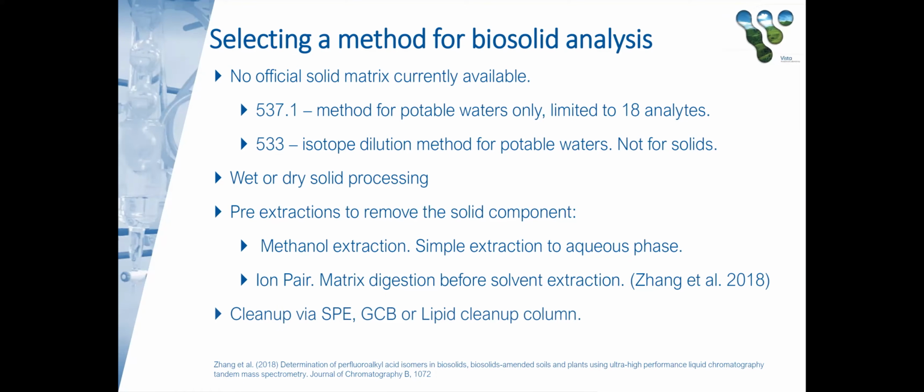Also, because we're monitoring known amounts of standard, we can monitor the retention times and help predict and qualify any retention time shifting of the target native analytes that may be caused by the matrix effects. Without this in place, it would be a subjective process of picking out the target analyte peaks. There's also an understanding that internal standard recoveries down to 10% are highly accurate and precise, and even below 10% may yield usable data when using isotope dilution.